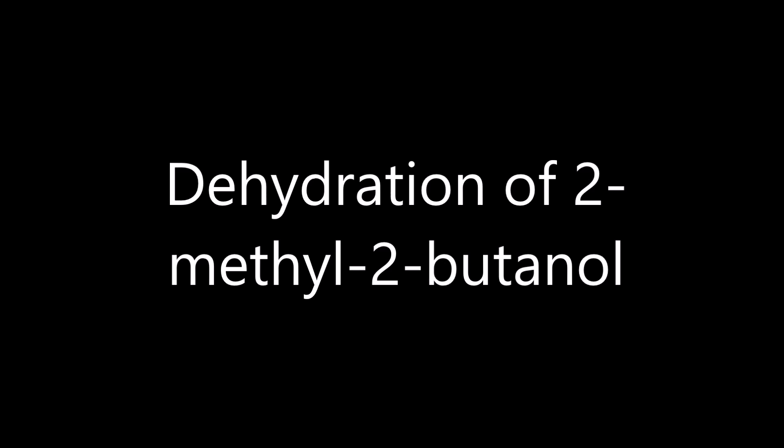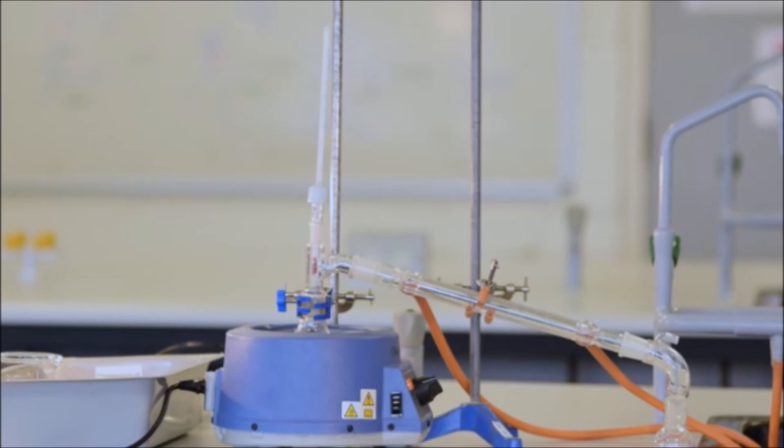Okay, so today we're going to perform the dehydration of 2-methyl-2-butanol to give 2-methyl-2-butene. To do that, we're going to have to distill the product from the starting material. So, we're going to set up a distillation.